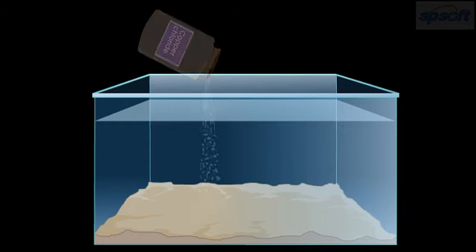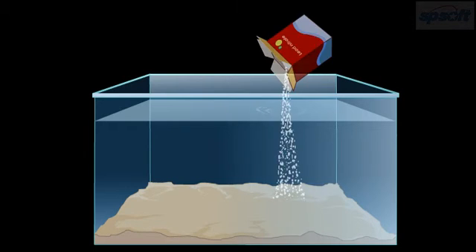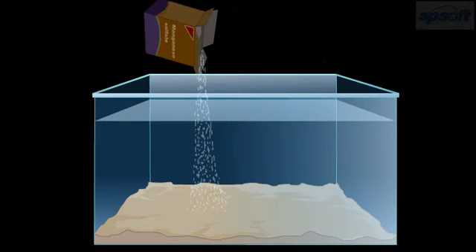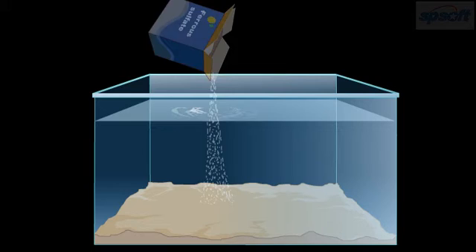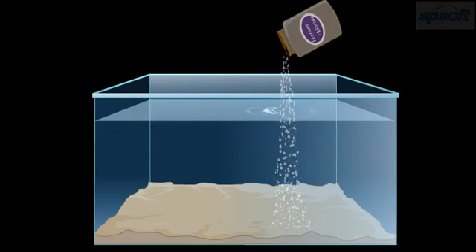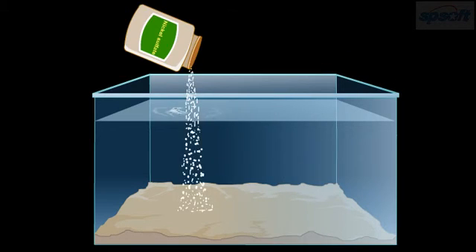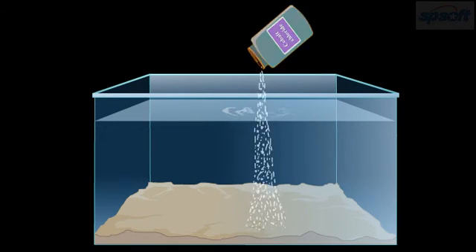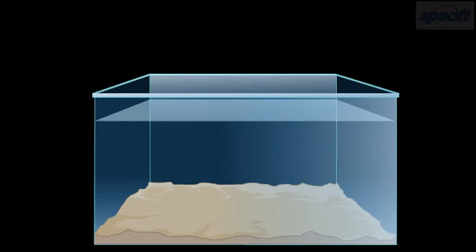Metallic salts like copper chloride, copper sulfate, lead nitrate, manganese sulfate, aluminium sulfate, ferrous sulfate, ferrous chloride, copper nitrate, nickel sulfate, cobalt chloride, and cobalt nitrate are embedded in the sand properly. Make sure that the case does not shake, as this can displace the salts.